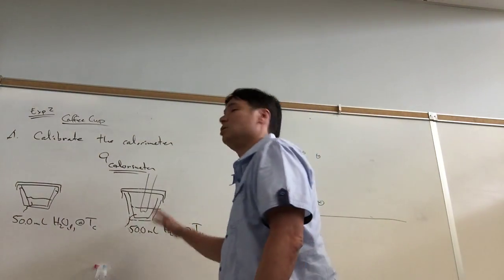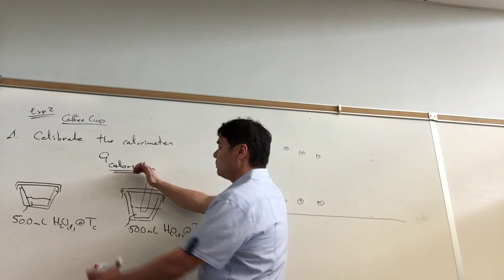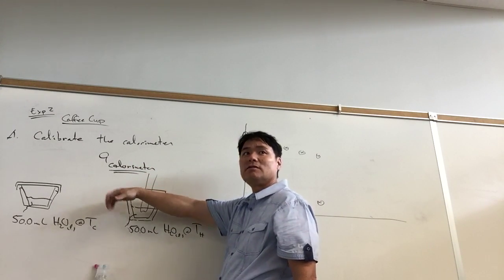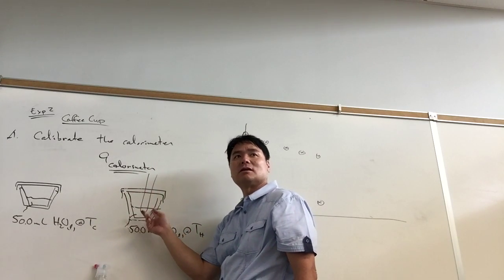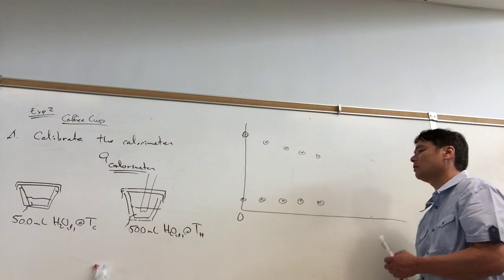It'll cool a little too rapidly, right? And so what you'll do is you'll just pop open the lid, dump in the cold water, close the lid. Okay, don't leave it sitting open for a long time, otherwise you're changing the characteristics of the container, the calorimeter, and that's going to change the cooling trend here.